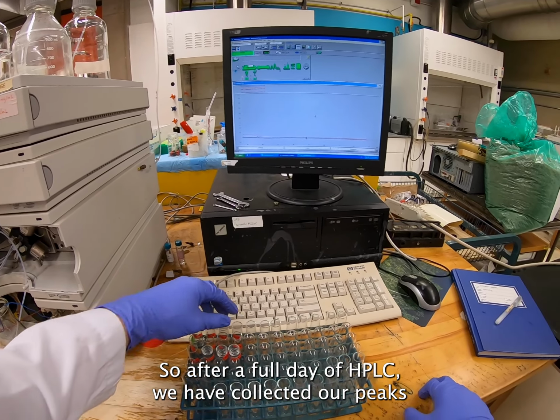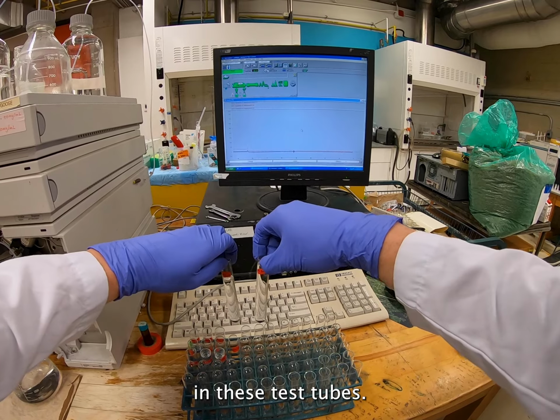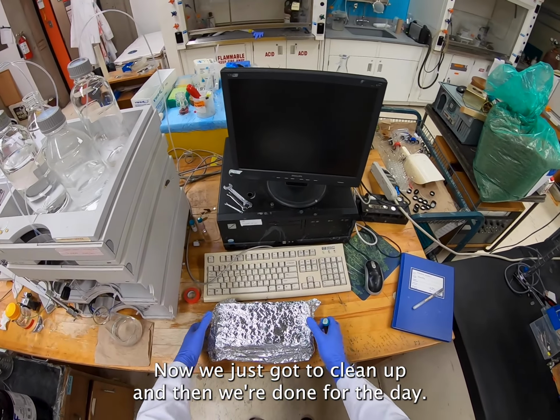So after a full day of HPLC, we have collected our peaks and now they're in these test tubes. Now we just gotta clean up and then we're done for the day.